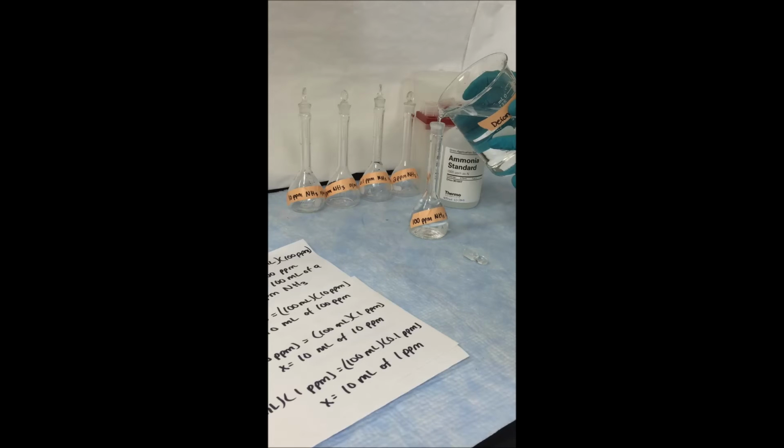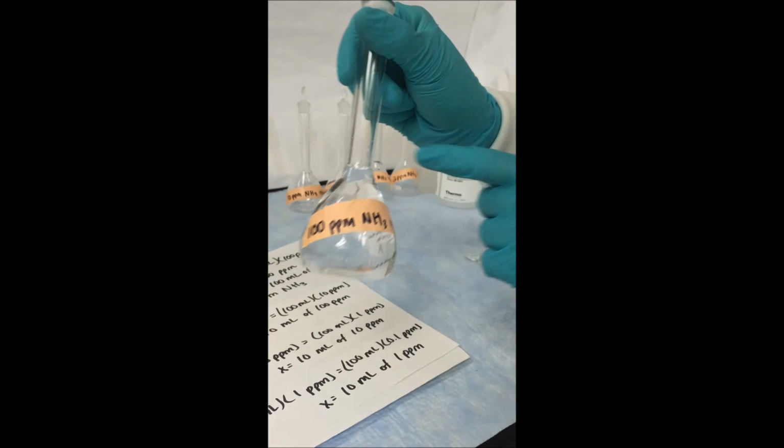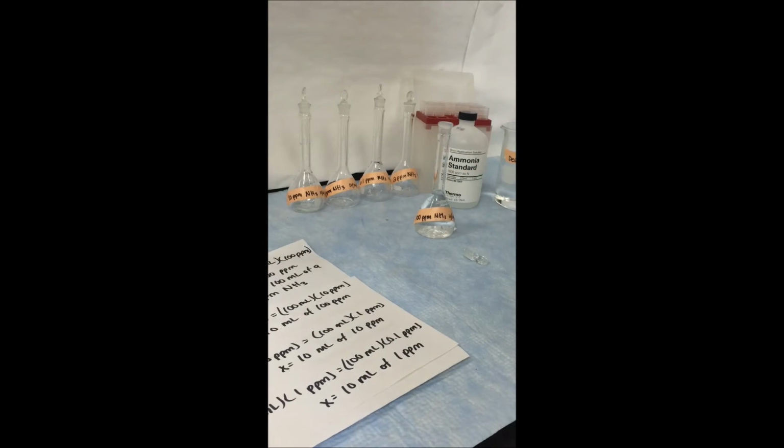It can be tricky to pour directly up to the line, so make sure to leave a couple inches of room, and using a pipetter, bring the solution to volume on the flask. Always make sure to use a fresh, clean pipette so you don't contaminate your water source. Once you have completed the solution to volume, seal the flask and invert it to mix the solution completely.